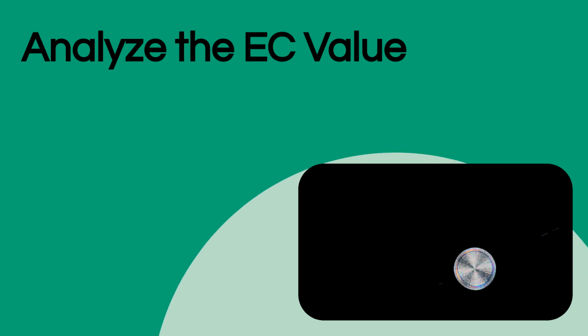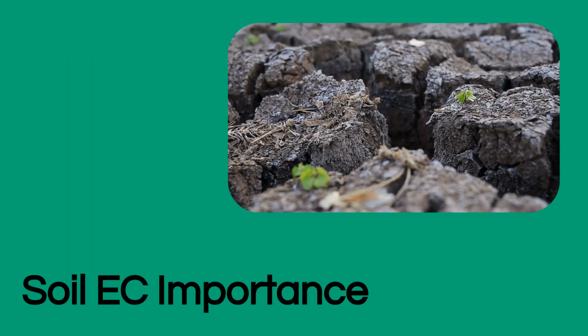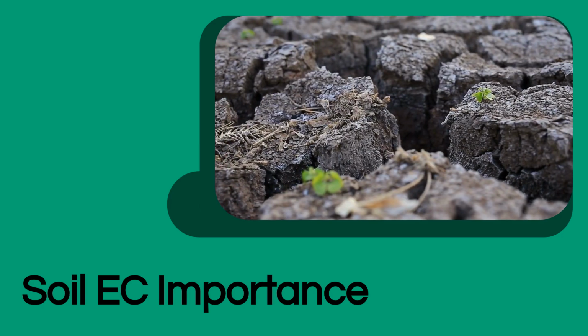Based on the measured EC value, you should now comment on the salinity level of the soil and its potential impact on plant growth. Understanding soil EC is crucial for managing soil health and ensuring successful crop yields, especially in areas prone to salinization.